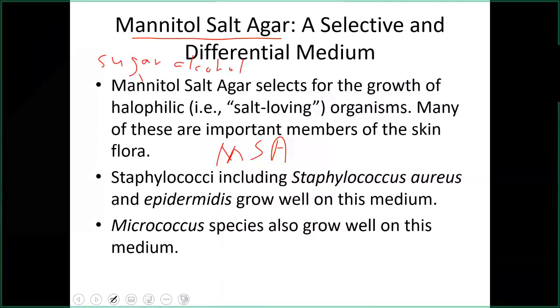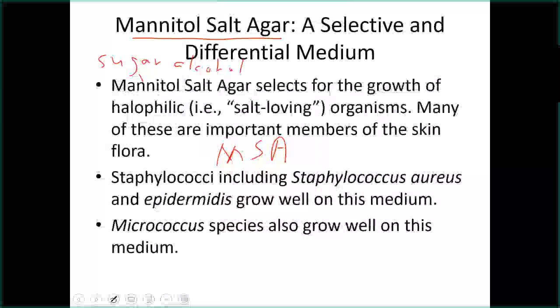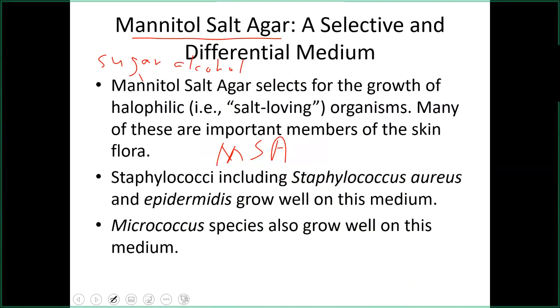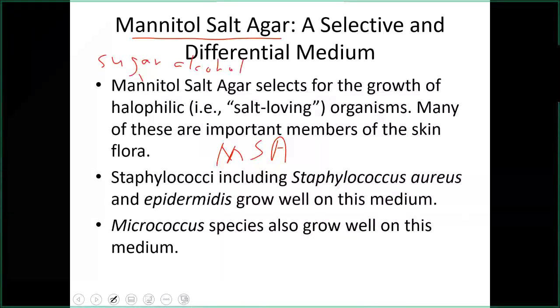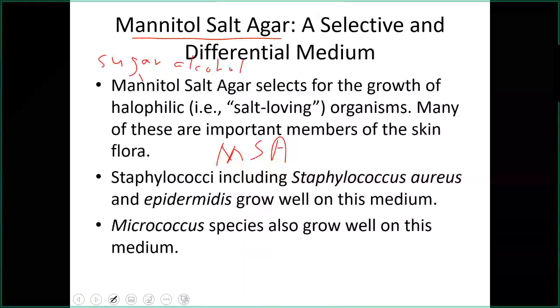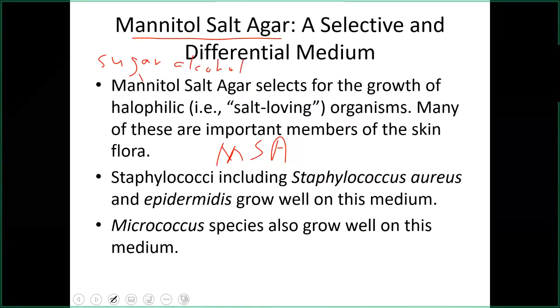And the salt, in the recent lecture on microbial ecology that I went through, that salt, when it's present in the surroundings, increases the solute concentration of the environment the organisms are in and tends to have a desiccating effect. It actually pulls water out of cells, right? Osmosis causes water to go toward the salt, essentially, into the hypertonic surrounding conditions. So some organisms can resist that really well. And so again, salt is in there as an agent to help select for particular organisms. Got those two things together.